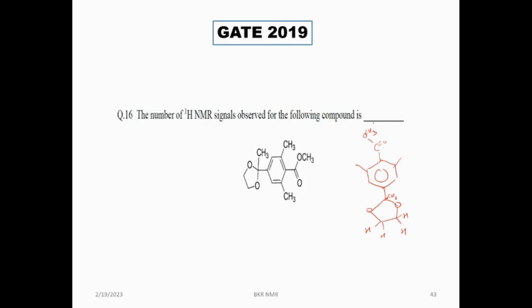So if I'm able to cut this molecule exactly like this, in the symmetry, what will happen? If I cut this molecule exactly in this particular symmetry, you know that this ester group is a bent group, so you can align it exactly and cut.